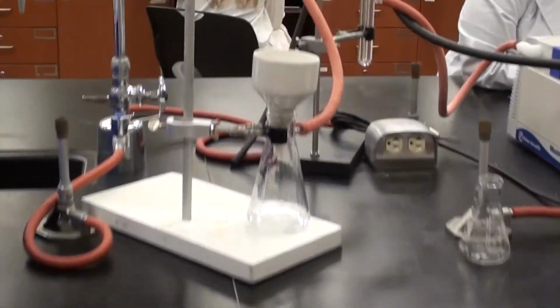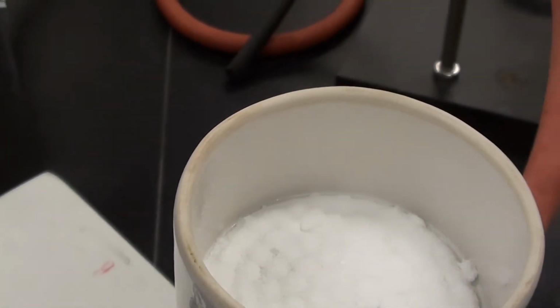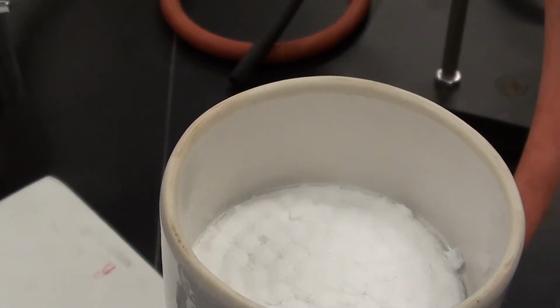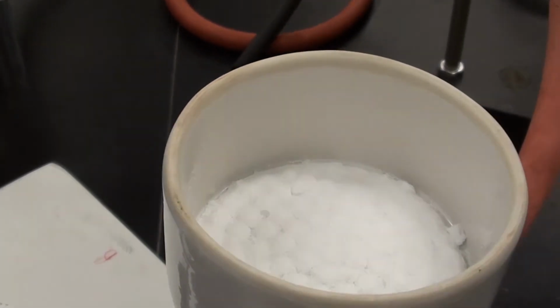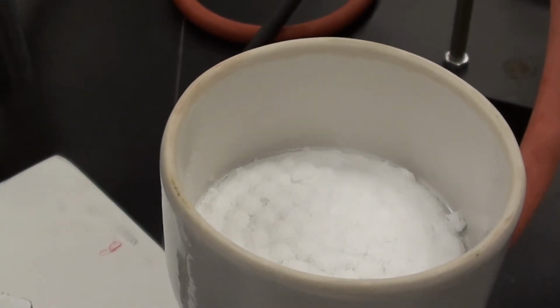And now you can see what the crystals look like. Yeah, nice white crystals. We're going to let them sit for a few minutes, probably about 10 minutes or so, because it does have water on it, and then we can weigh it and take a melting point.